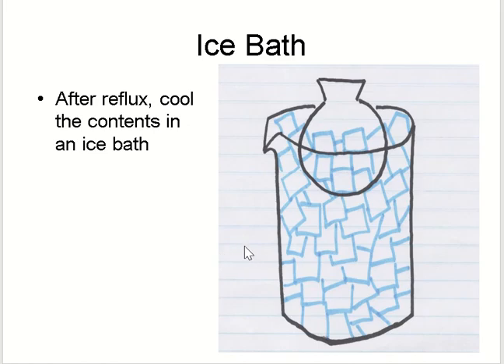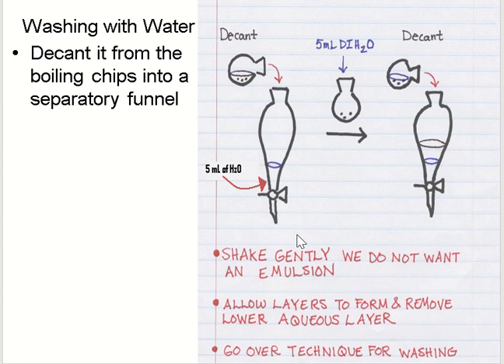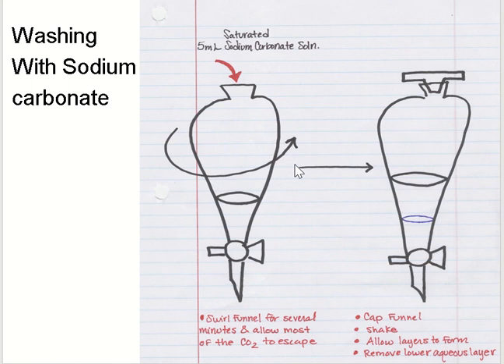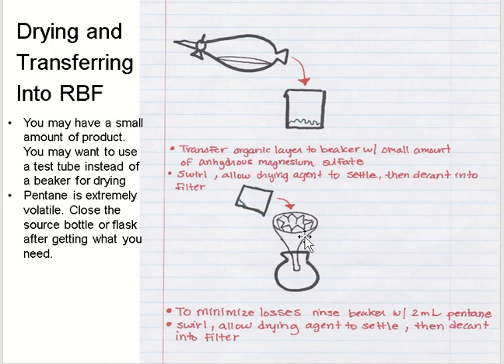After reflux, use an ice bath to cool the product. Then wash your product with water using a separatory funnel — shake and remove the aqueous layer from the lower side, and take the upper layer as your product. After washing with water, wash with sodium bicarbonate in the same way and collect the product from the upper layer. After that, dry it and transfer into a filter paper. You may want to use a test tube instead of a beaker to minimize product loss.